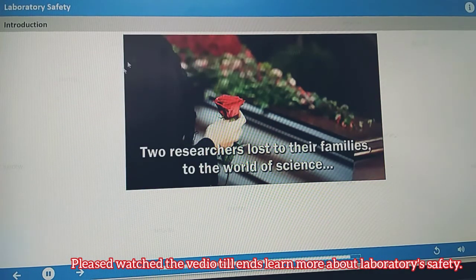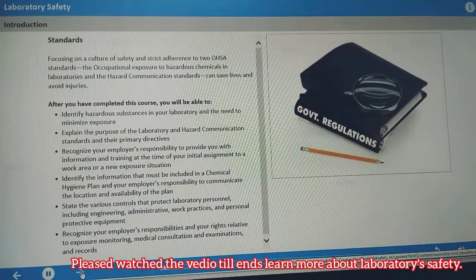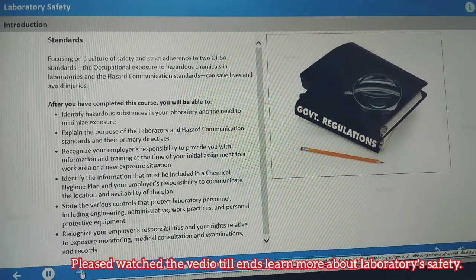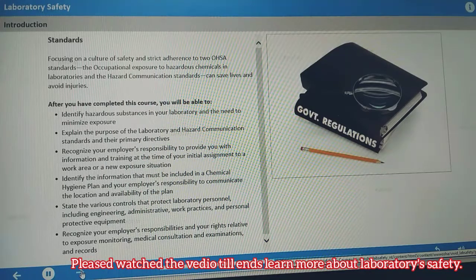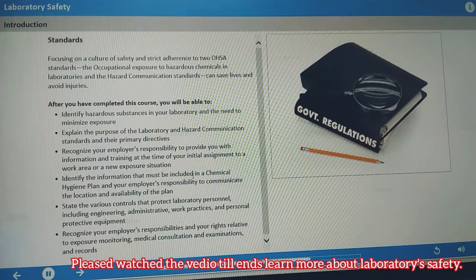Two researchers lost — to their families, to the world of science. As these examples indicate, laboratory hazards have the potential to be fatal. Focusing on a culture of safety and strict adherence to two OSHA standards — the Occupational Exposure to Hazardous Chemicals in Laboratories and the Hazard Communication Standards — can save lives and avoid injuries. This course provides an overview of the hazards present in non-production laboratories, the standard requirements that are intended to protect you, and some basic controls suited for the laboratory environment.